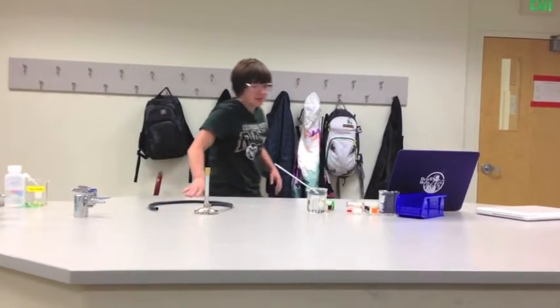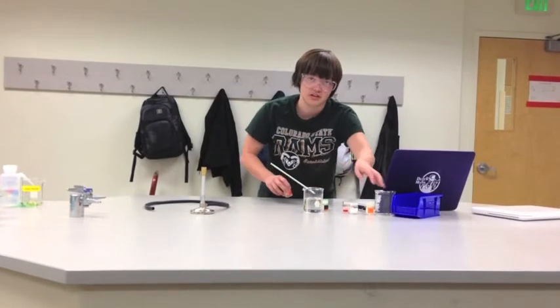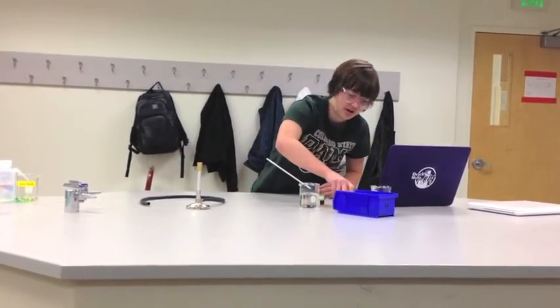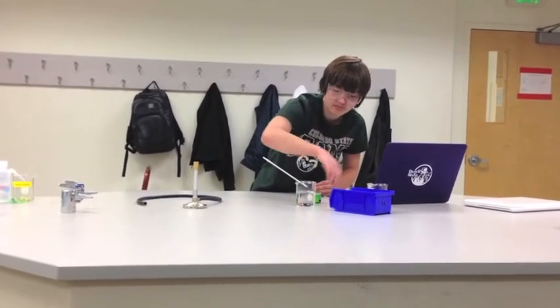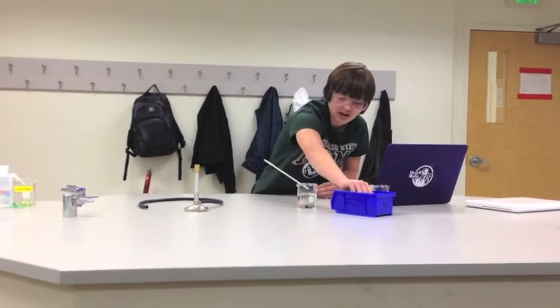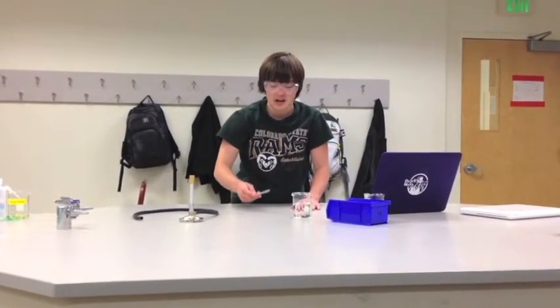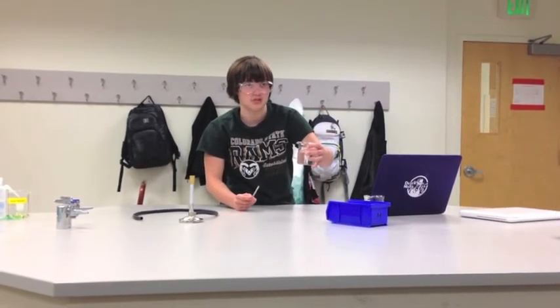Then you want to place any salts that you used back where you found them or in the place that you made by your TA. From here, you should go ahead and rinse off your wire, put it also back where you found it, and empty out your distilled water into a liquid waste beaker. Now that you've seen these salts, look at the table and tell us which one you think it is.